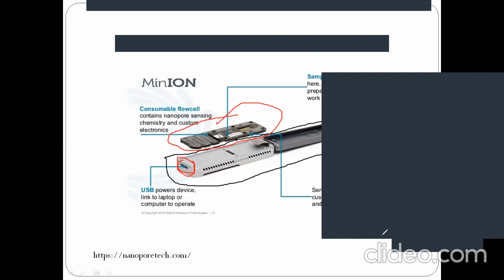There is dedicated software in their laboratory in the United States, so they can easily check whether in your laboratory you performed adequate cleaning in between the sample runs. Once they find that in spite of adequate cleaning you could not run 50 samples, or maybe over 30 samples, they will replace it. And replacement means that next time onwards, for one replacement of one flow cell, they will charge only 50% of the total cost.